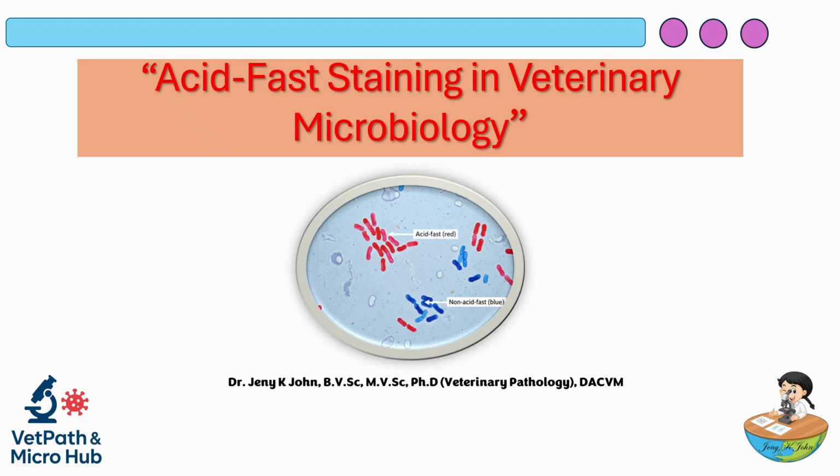Today we will learn about acid-fast staining, a crucial technique in veterinary microbiology. This staining method helps us identify bacteria that resist ordinary staining due to their waxy cell wall, like Mycobacterium species.